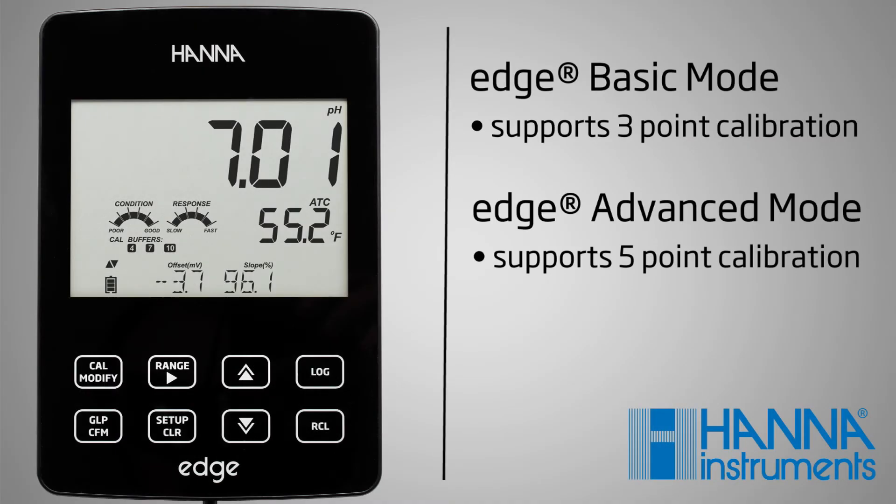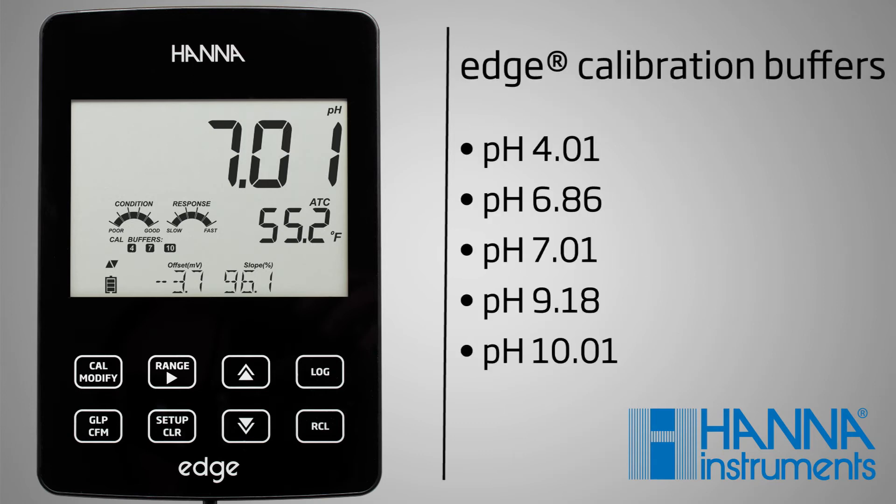Your Edge meter supports a three-point calibration in basic mode. Calibration buffers can be selected from the calibration buffer list that includes the standard and NIST buffer set.